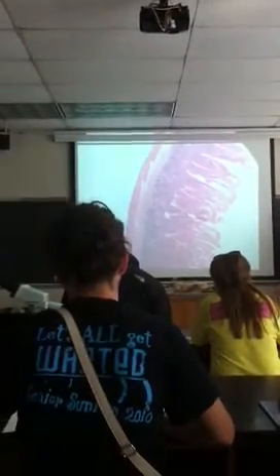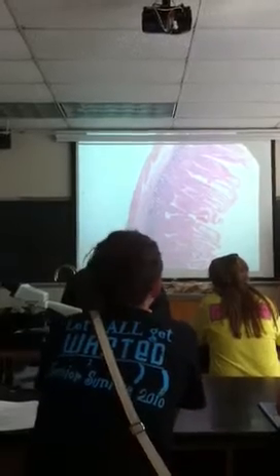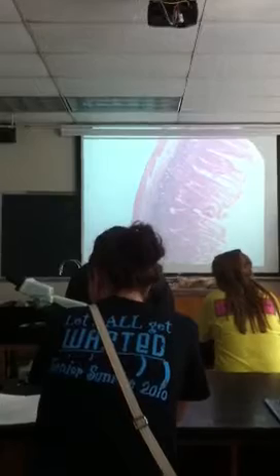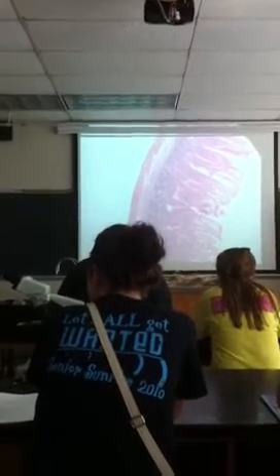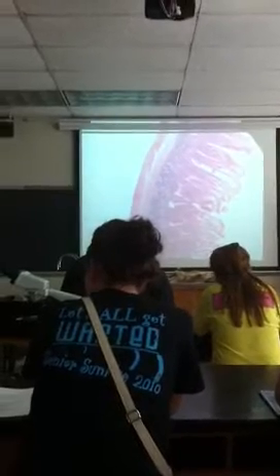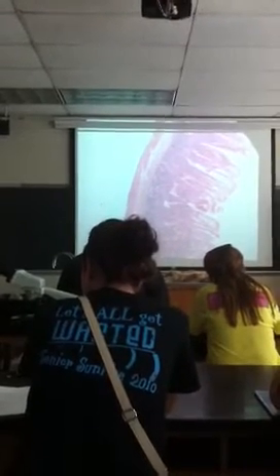So with the jejunum, this middle part of the small intestine, it's really not doing any sort of special job. It's just responsible for some absorption of nutrients, right? Like all the small intestine is. So you don't need to see anything specialized in the submucosa in the jejunum. So I'll show you one that's got nothing in the submucosa, then you're going to assume it.